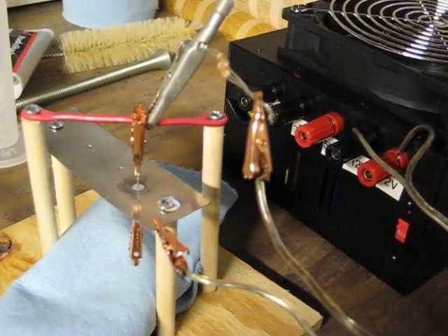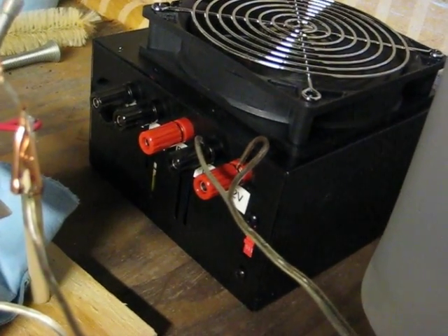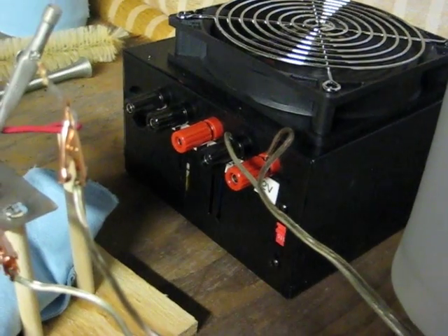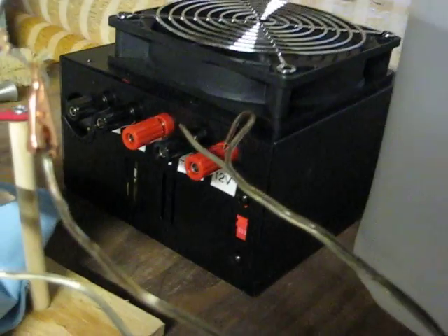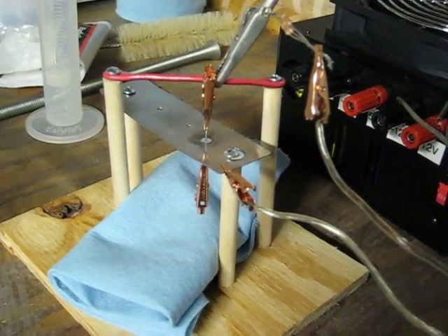What you're seeing here are the connections to negative and positive, going over to the power supply — a modified ATX 400 watt power supply for a computer. I've got it plugged into plus and minus 12 volts, so I've got 24 volts going across here.